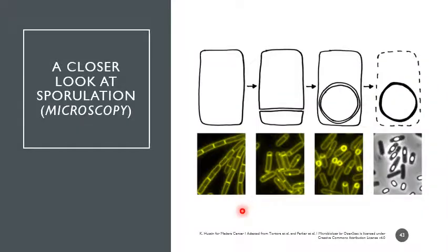In terms of the microscopy, we can actually kind of see this development occurring and the spore glowing. Different bacteria at different stages of development have the spore located in different areas. The location of the spore when it forms really helps us identify that particular pathogen.